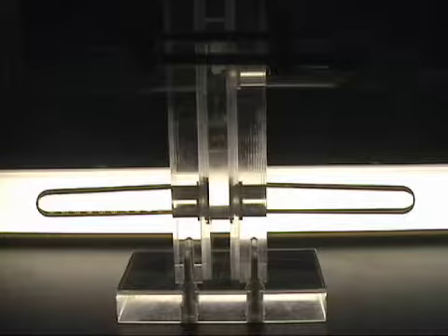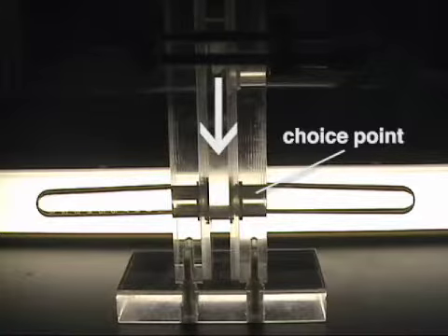The flies are transported down the maze in a central elevator to a choice point where they have the option of entering either arm of the maze.